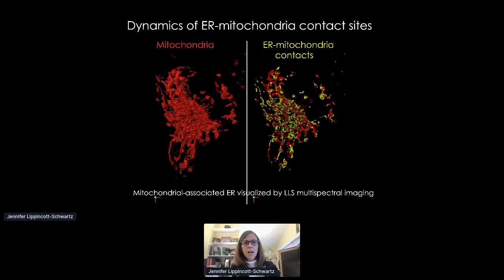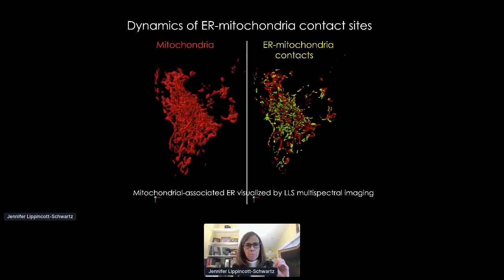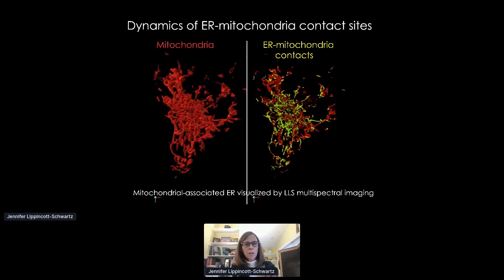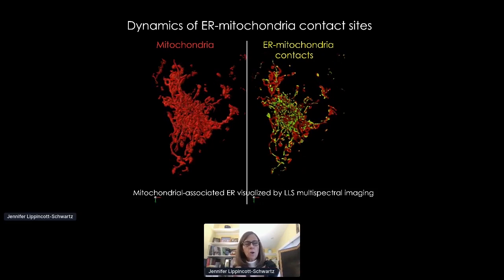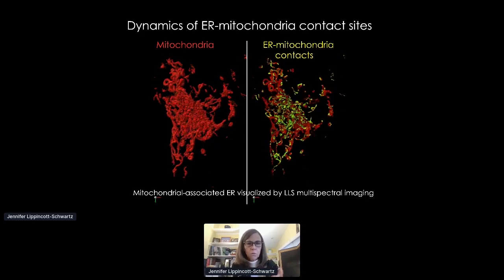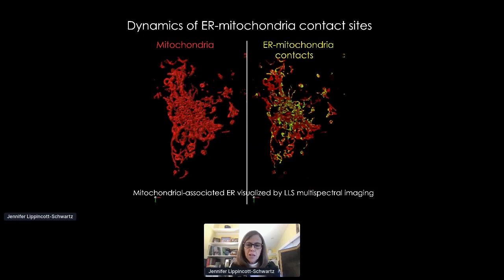It's a moment of time in the cell. In order for us to understand how these dynamics, how these organelles are actually playing out over time, we need additional technologies to clarify that. And that's what you're seeing here.